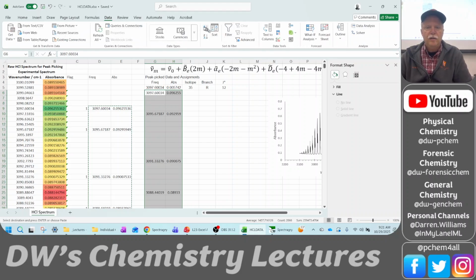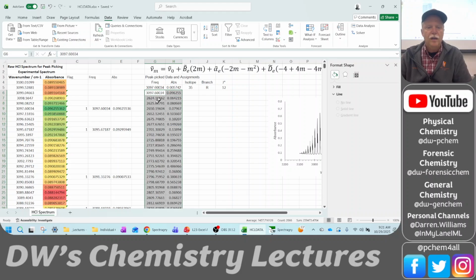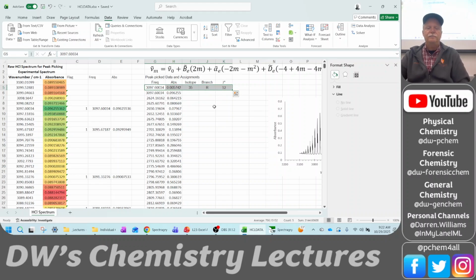Data, sort A to Z or low to high. So I want, actually, I think one low to high. Okay. And so here they all are, sorted low to high. It treated that top value as a data label, actually. I put this first line in here just for you guys to have an example of what to start with, but we don't really need that one.